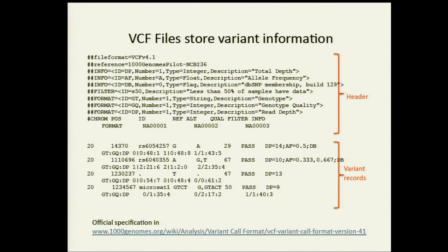Now, you might get thrown for a loop by this record down below. You can represent more than 1 altered allele in any record. So you'll see this sample here is 2, 1. This person has a GT genotype. Reference is A, so you're a heterozygous variant. And this is a TT. 2 is the T, 1 would be G, and 0 is A. And no one here is actually reference. So that's a lot of detail about the VCF, but you'll need to know that for modules downstream. I know that because I wrote one of them, so I just want to give you that.